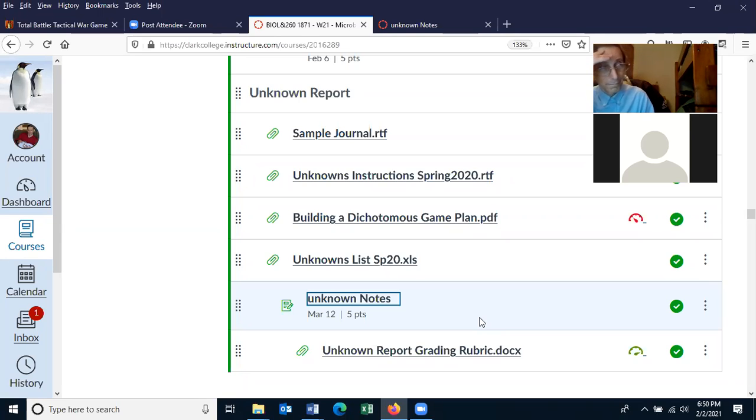and let me think about that. That's not right. You're going to start the gram stain on Sunday, and then you'll start the lactose fermentation test on Monday. And then on Tuesday, I can send everybody the results to all 3 of those tests, because the gelatin hydrolysis will run for a week. The gram stain will be grown.